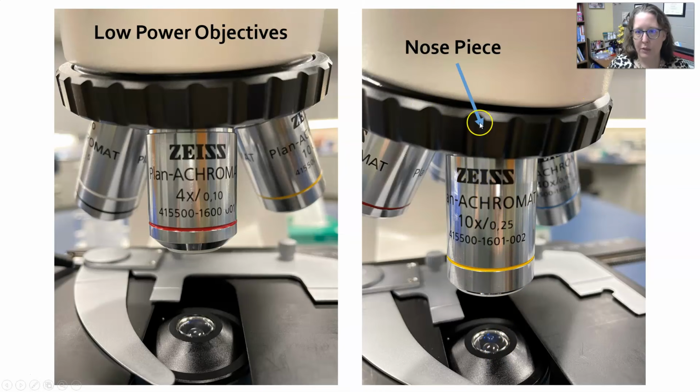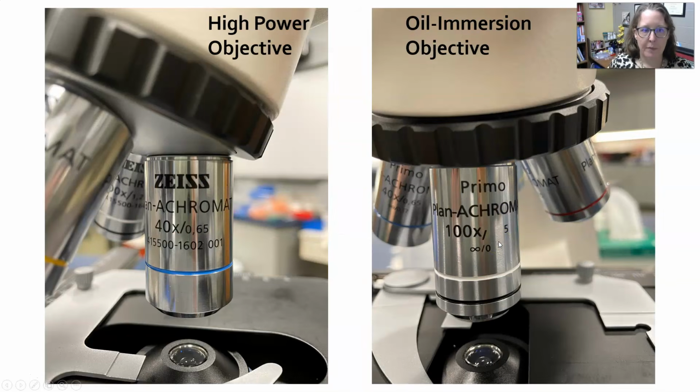The piece that you can rotate to switch to different objectives is called a nose piece. It is best to rotate the objectives by rotating the nose piece and not by grabbing the objectives. And then your high power objective is going to be your 40x. And you can see these are planochromatic lenses.